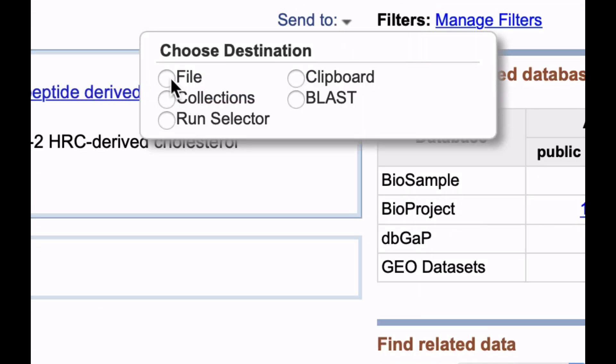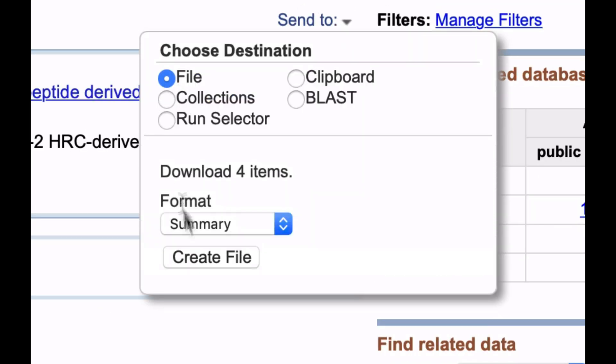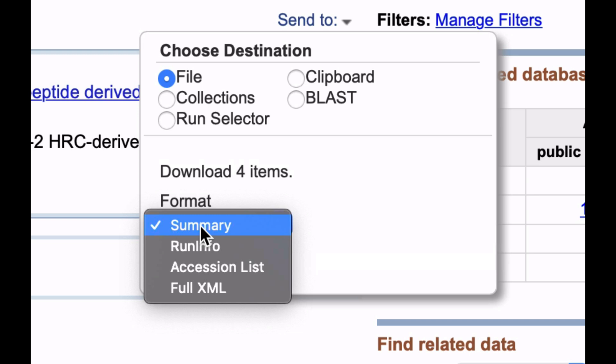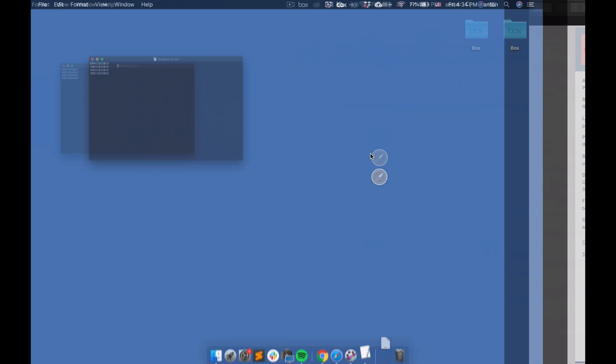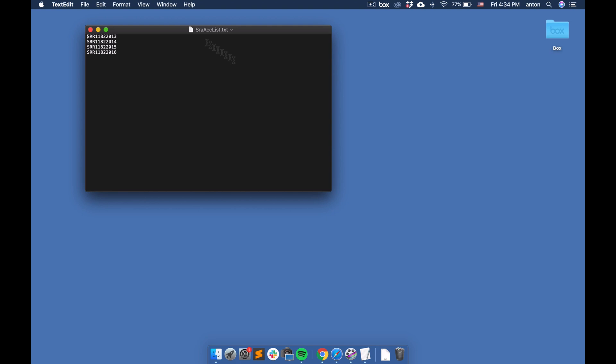Send to, File, Accession List, Create File. Let's generate a file which looks like this.